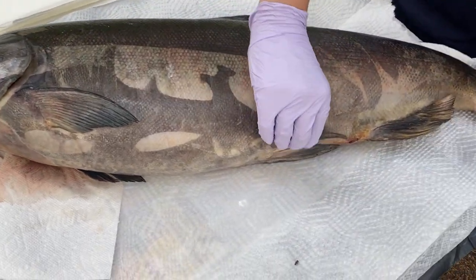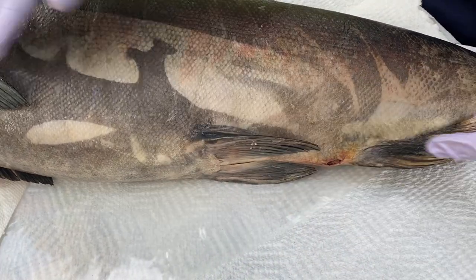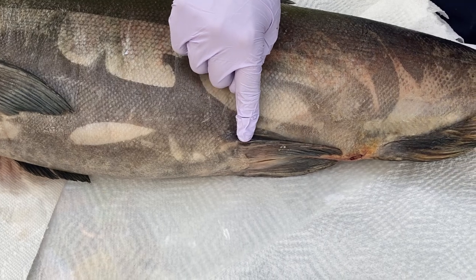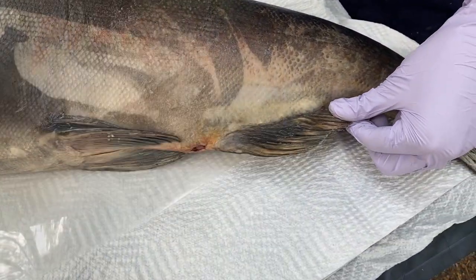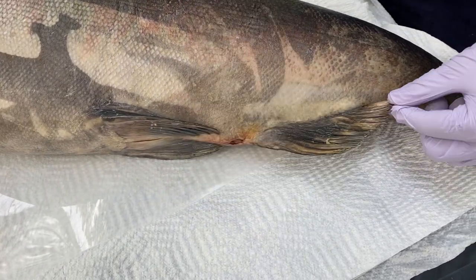We'll move down the fin. We have two fins on each side here. And these, think of it like a human again. These are going to be the fish's pelvic fins, or like where our hip bones would be. And then we have this fin, it only has one. And it's going to go all the way down here, and this is called the anal fin.